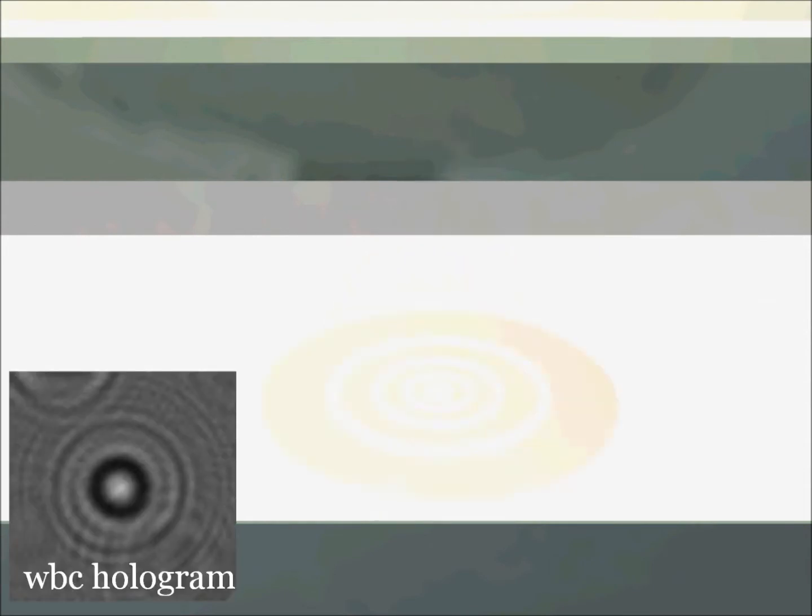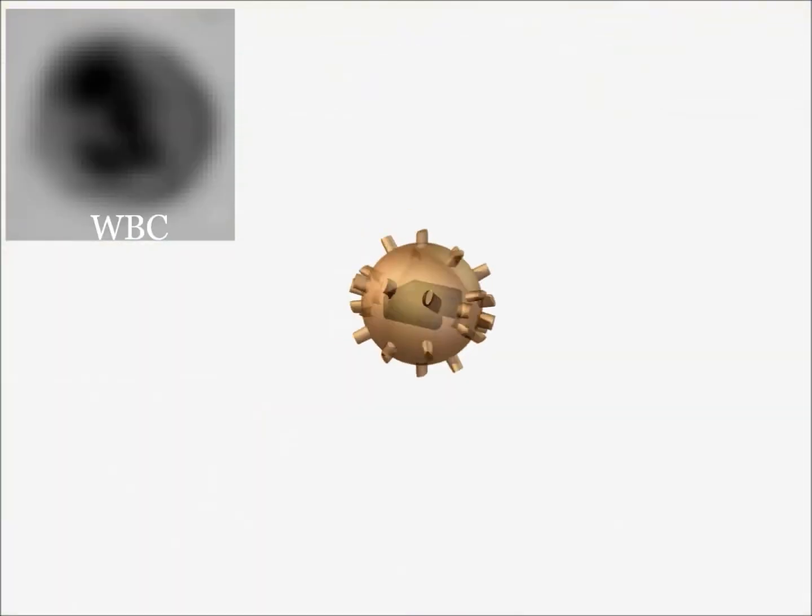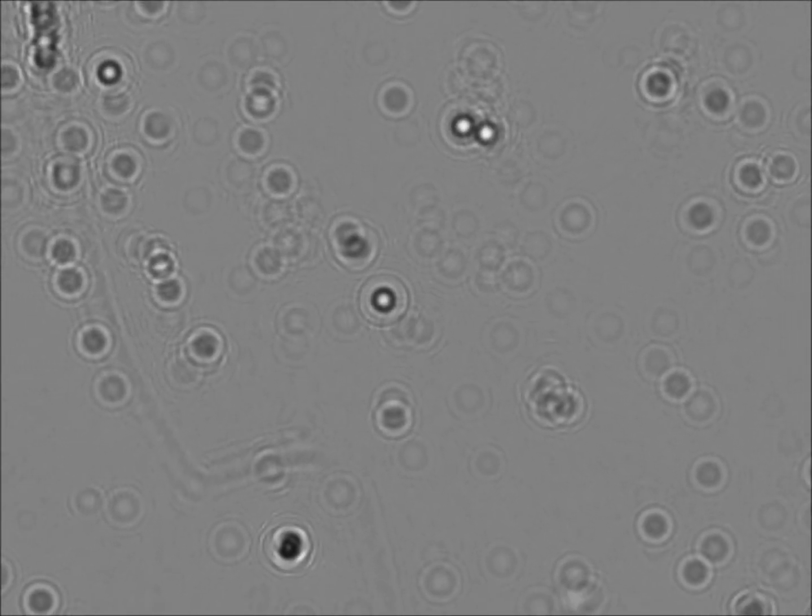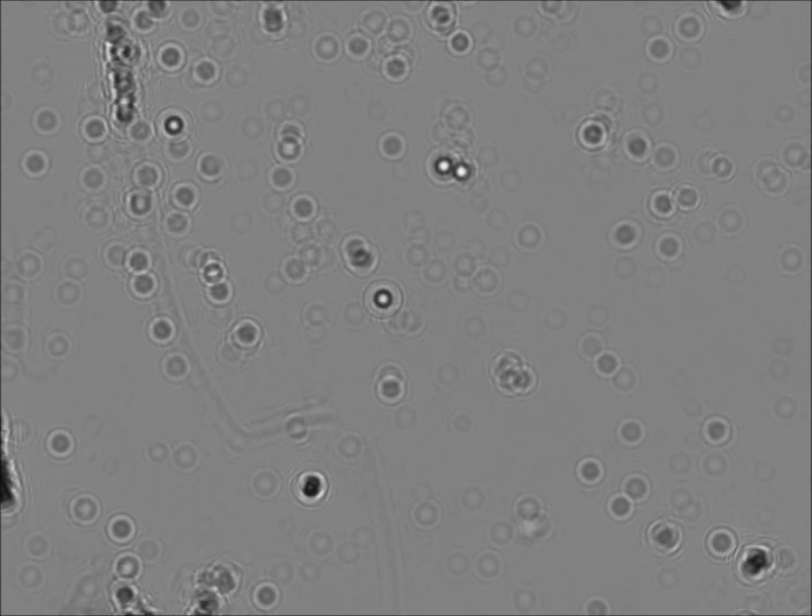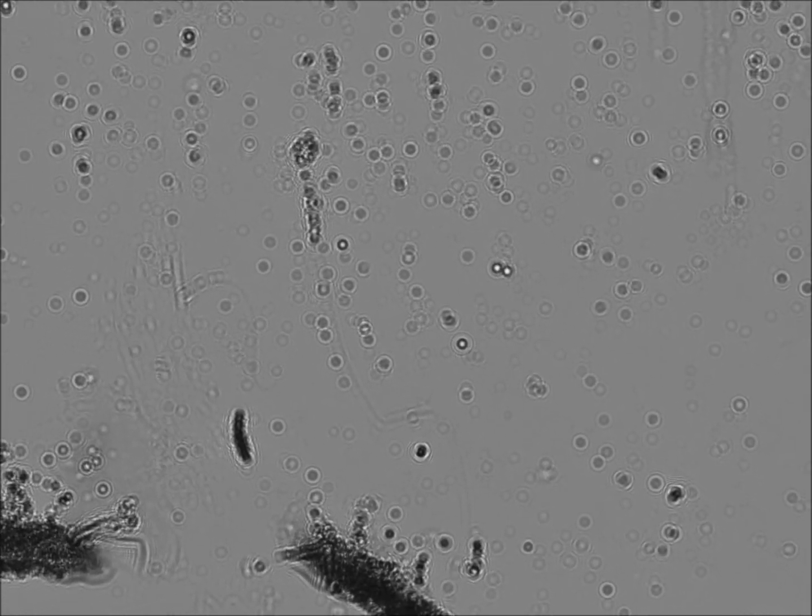For example, this is what our sensor records for a hologram of a white blood cell, and here's what it looks like after processing. One advantage of the way we do holography is that we can image thousands of cells in one shot.